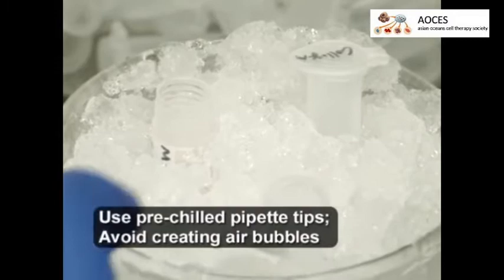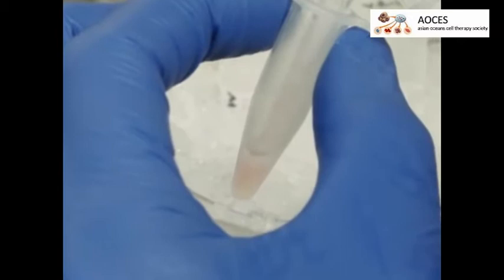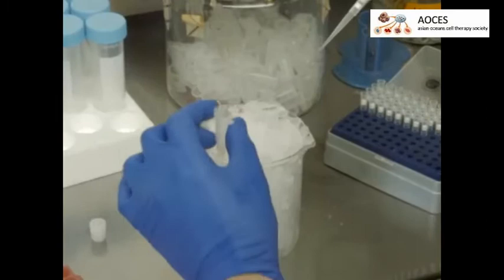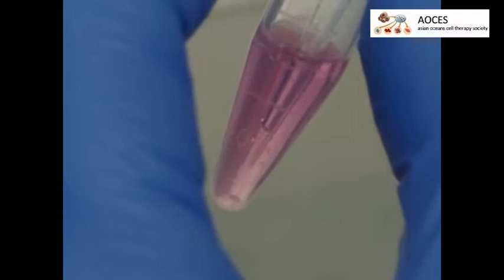Next, mix 100 microliters of the thawed basement membrane solution with 100 microliters of 2.3 mg per milliliter cold type 1 collagen solution in a pre-chilled 1.5 milliliter centrifuge tube. Incubate the extracellular matrix, or ECM, mixture on ice.